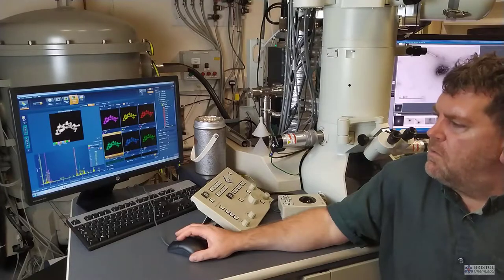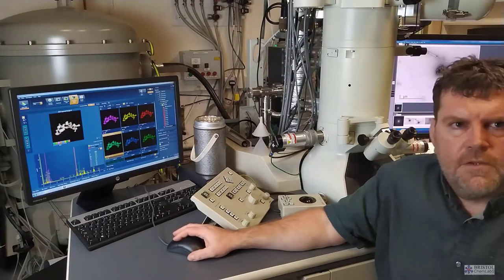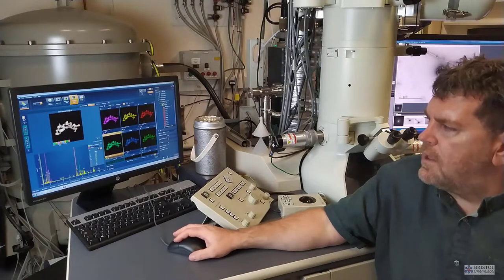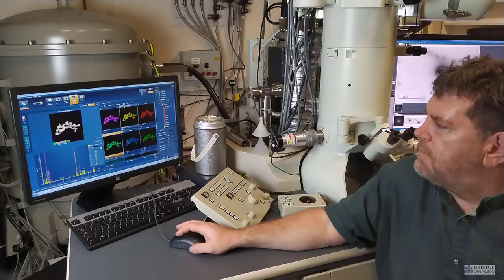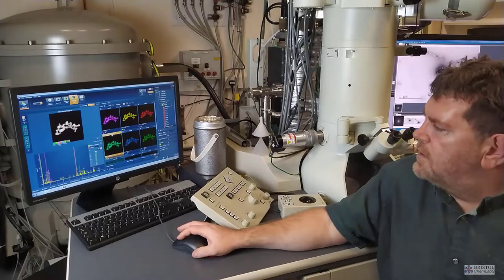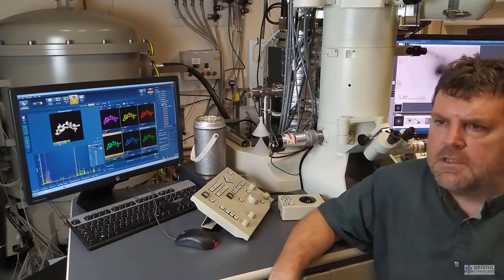So in this example here, we've got some samples that have been produced by one of the research groups on the crystalline nanomaterial, and we can see the distribution of copper, iron, oxygen, neodymium, cobalt, and chromium within those particles.